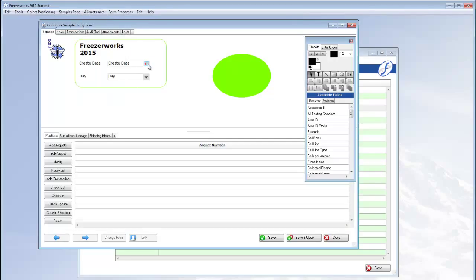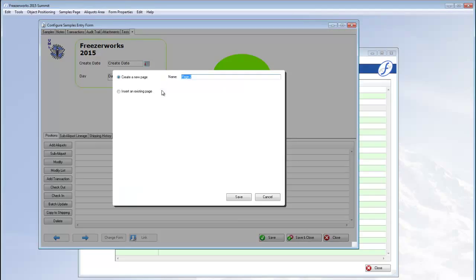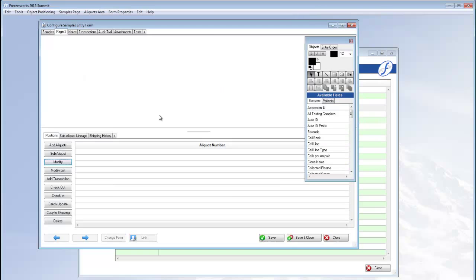You can have multiple samples pages, so some of them may not need an aliquots area. Click the plus sign or samples page add page.